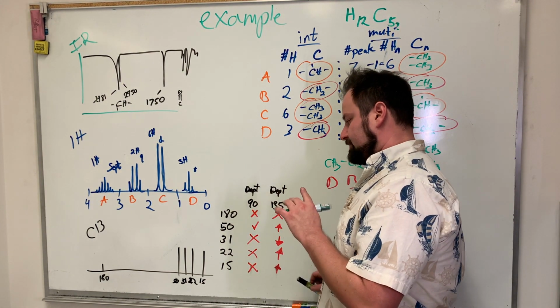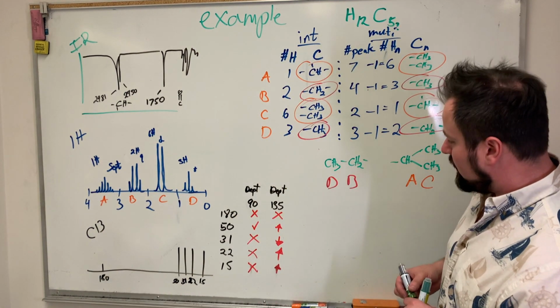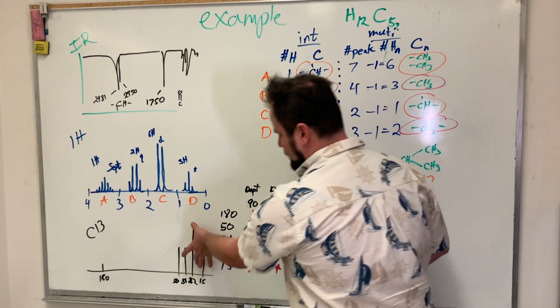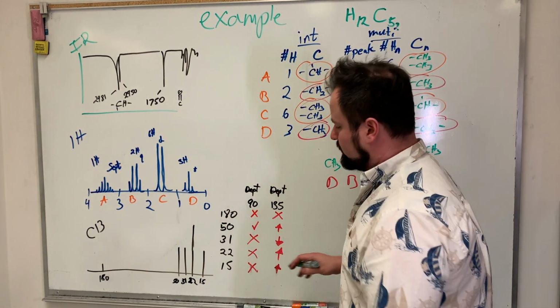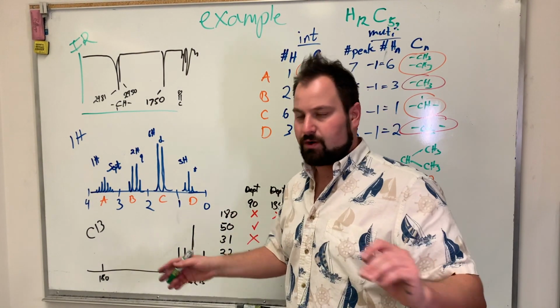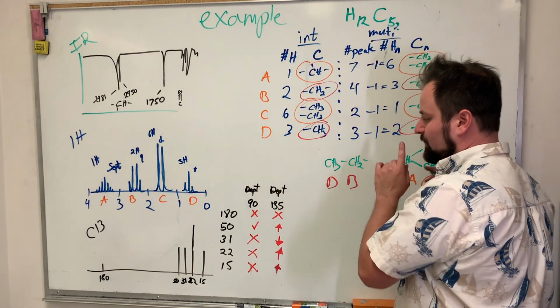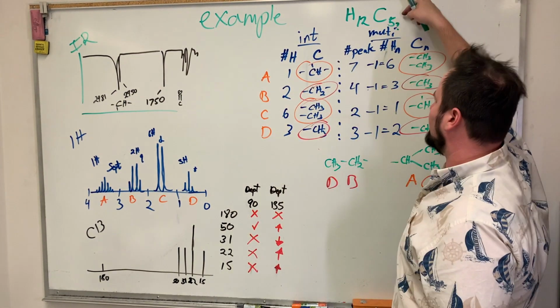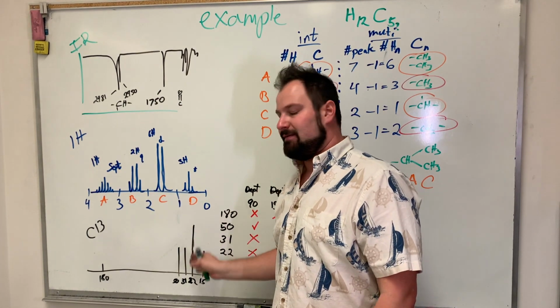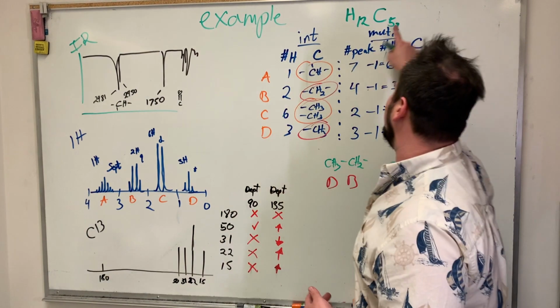Now, for this, I did make a little weirdness here. So for our carbon, I made a little correction here. This one is in fact twice as tall as it should be because we do have symmetrical. You of course won't be doing corrections. I'm just working with this quickly off the fly. But we can see here that it could have been 5, but it could have also been 6 if that was a double. Even if you didn't see that, and I made it nice and clear now, it's not guaranteed that you're going to see it every time. That's why I put a question mark.